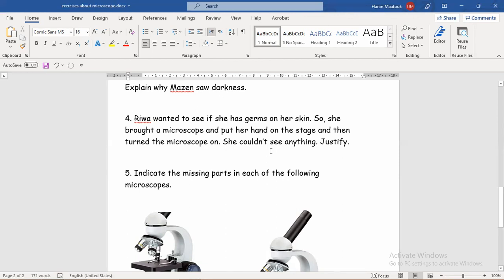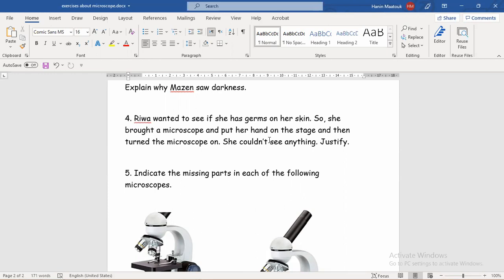Why couldn't Rewa see anything even though she turned the light on? Simply because she put her hand on the stage. As you know, hands are opaque — opaque means they are not transparent, so light does not pass through them. When she put her hand on the stage, the light from the light source goes up to the stage, but the hand of Rewa is opaque and thick, so the light will not pass through it. It stops, nothing is reflected, and she cannot see anything. She didn't use a transparent slide — she used her opaque hand.